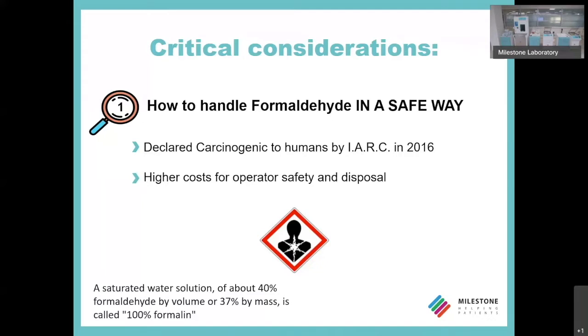Okay? So the reclassification of formaldehyde forced safety officers in hospitals, hospital administrations, and laboratory managers to handle it in a different way, and therefore at a higher cost for operator safety and disposal.